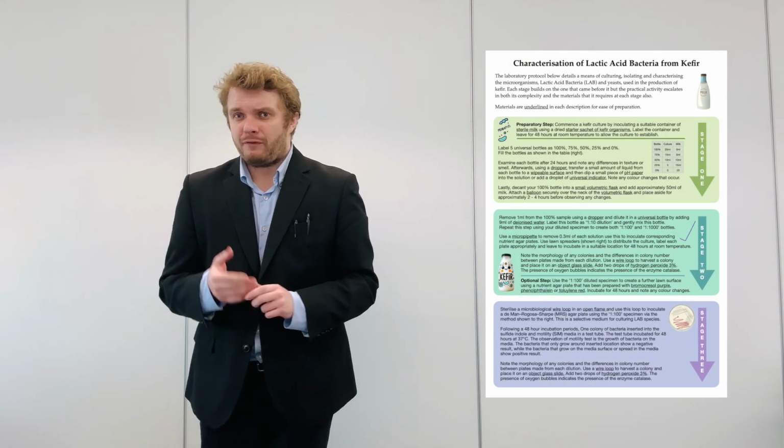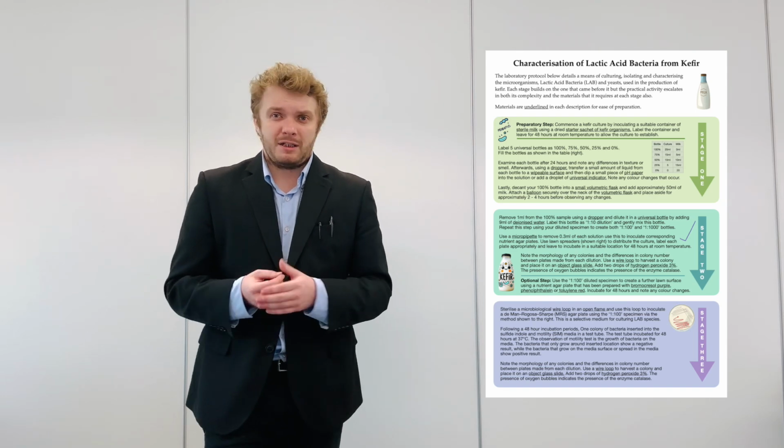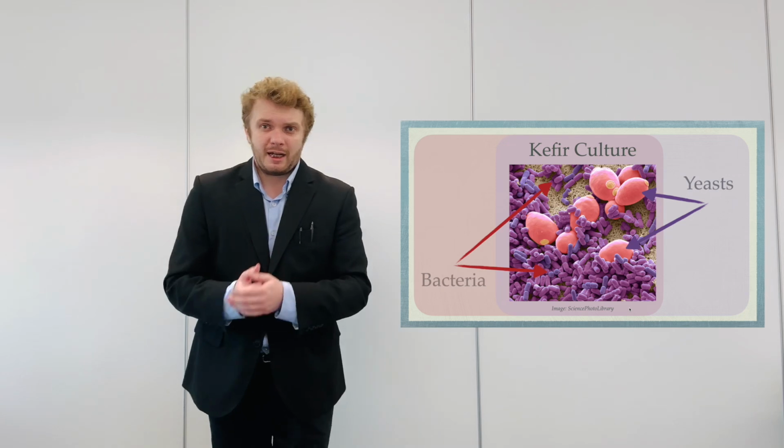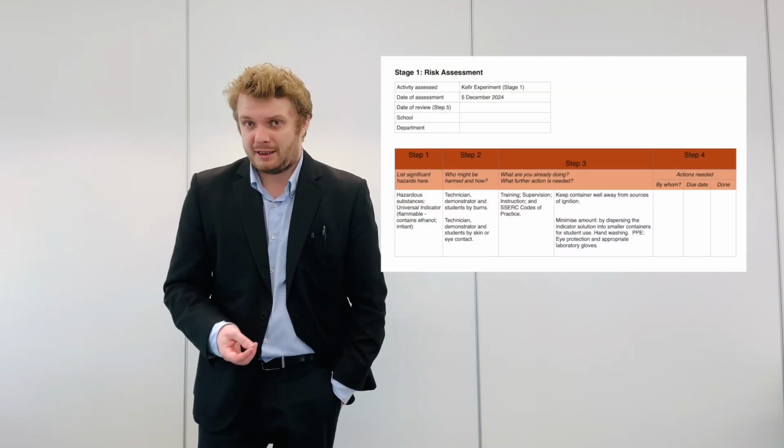The activity has been divided up into 3 stages, with each one being an escalation in both material requirement and complexity. The lab is cumulative, which is to say that in order to undertake stages 2 and 3, you must first have completed stage 1. In addition to this video, the file that has been shared with you should contain a very succinct one-page protocol that's designed primarily for your benefit as the teacher. You should also find a 20-slide PowerPoint presentation that I hope you might find helpful in delivering your own lesson prior to the lab, as well as a risk assessment.